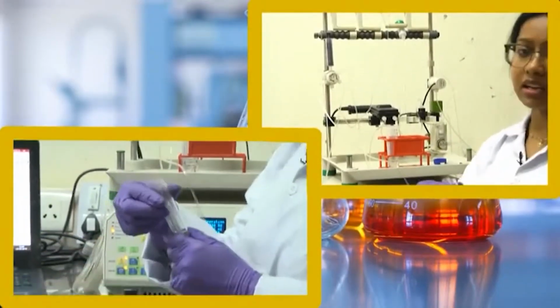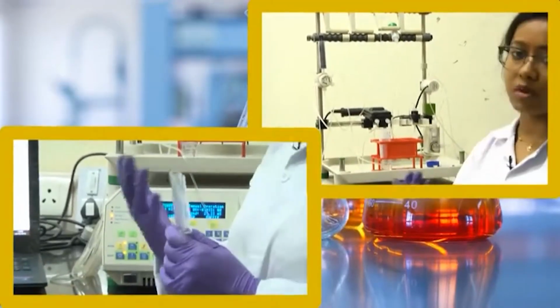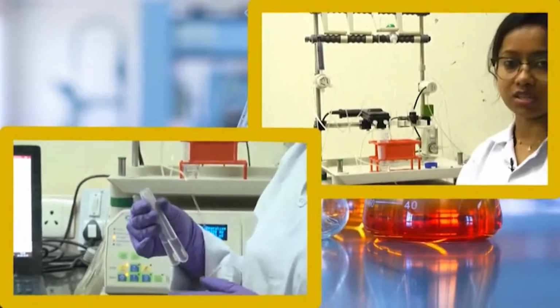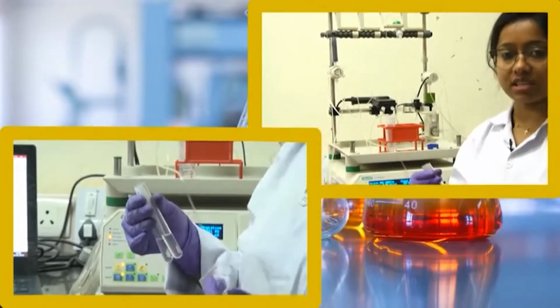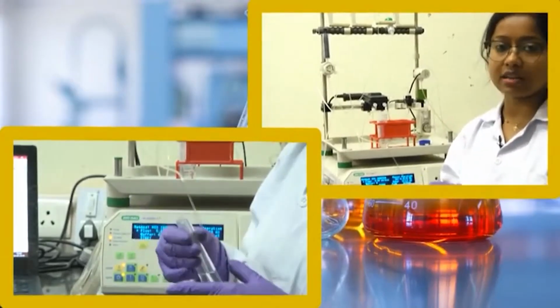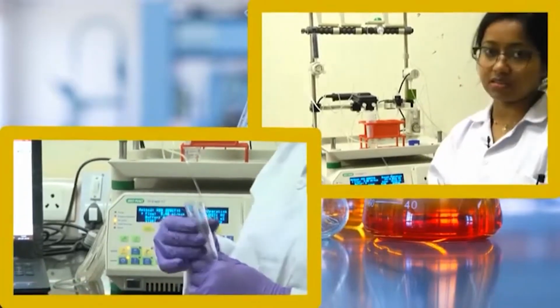If there is another contaminant protein present, you know the molecular weight of your protein. Suppose it is a 15 kilodalton protein and you also see something at 20 kilodalton, or 7 kilodalton, or suppose 50 kilodalton, that means that is an impure contaminant present inside your solution.